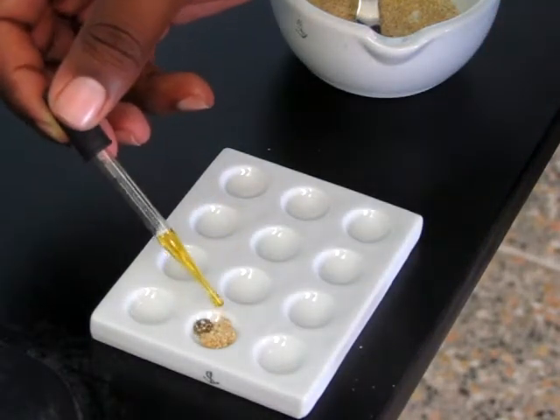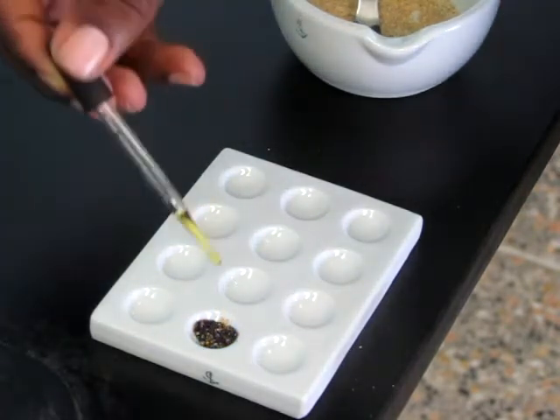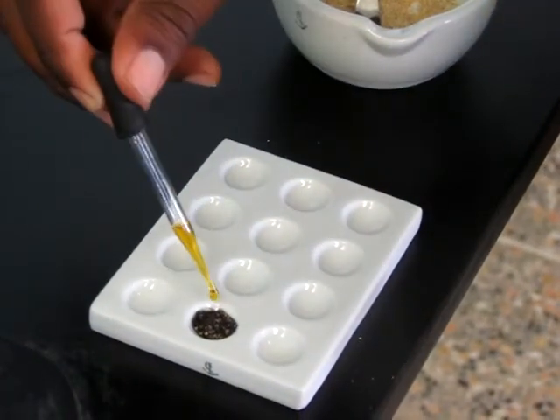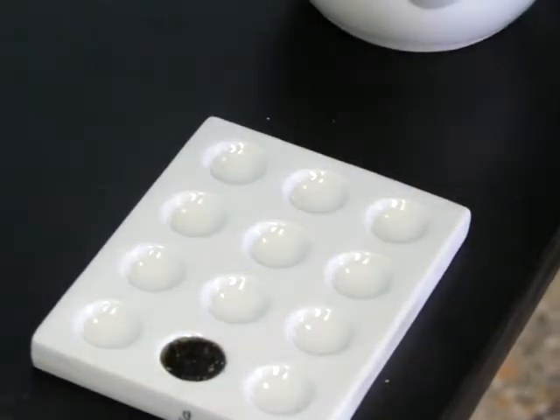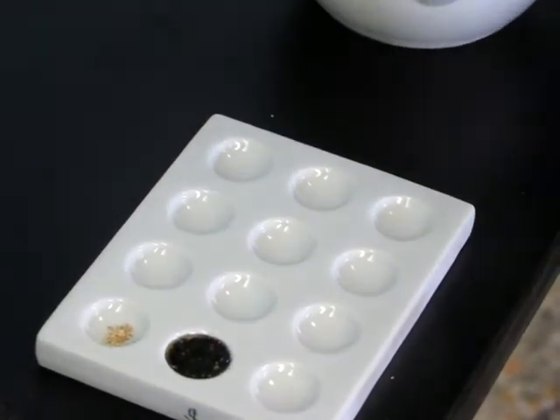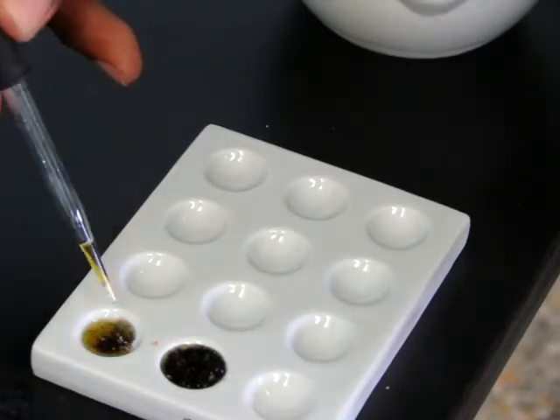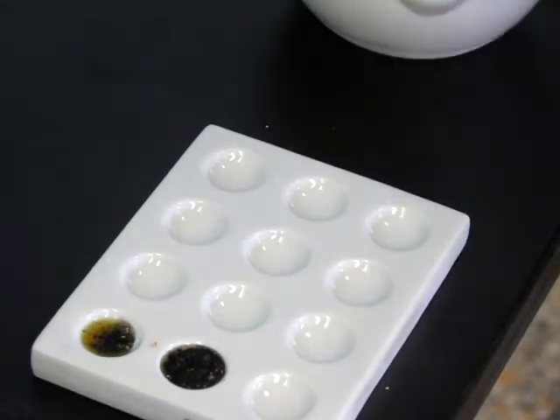We will drop some of the iodine solution onto the feed. The straw-coloured iodine solution will go blue-black to show the presence of starch. By repeating the test, we ensure that our initial results were correct. There is starch present in the feed sample.